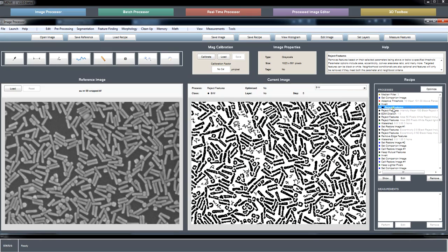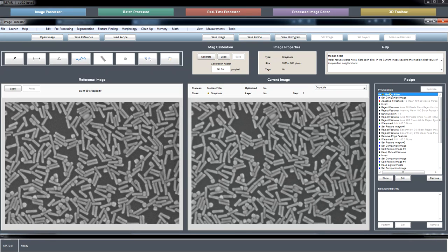So, yeah, here we had, again, our trusty adaptive threshold, some cleanup steps. We rejected on the basis, in this case, of what I did here: this can be a handy feature, we took our grayscale image and we set that up as the companion.